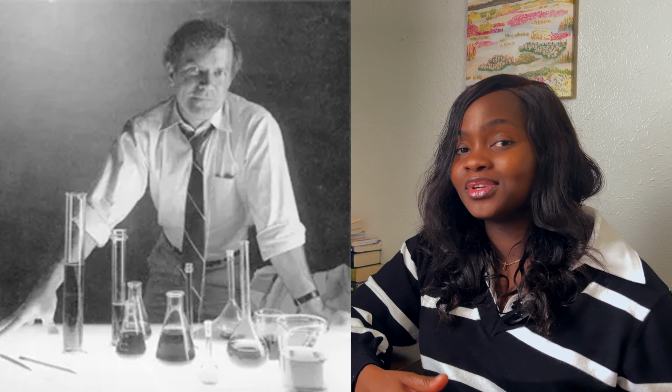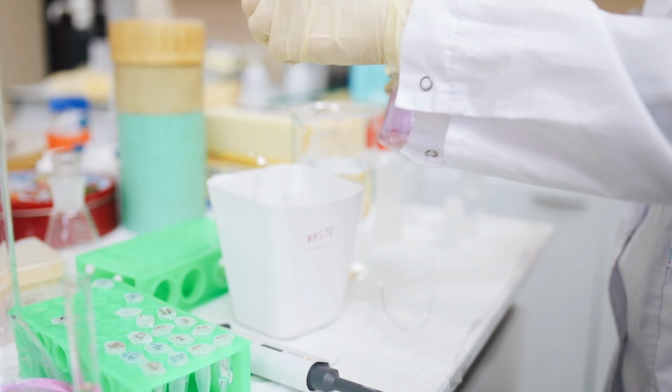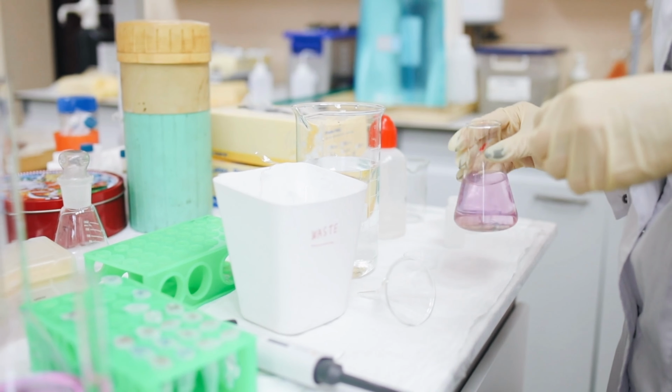I can imagine that as far back as when PCR was first discovered by Kary Mullis, they actually went through a lot of steps trying to find the optimized temperature to do denaturation and every other step following. In fact, what they did then was that they took the biological sample, the DNA, and moved it from one water bath of, let's say, 98 degrees Celsius to another water bath of a lower temperature to continue the steps.